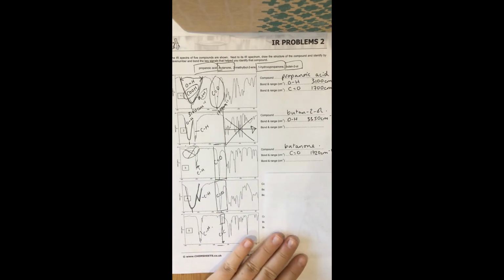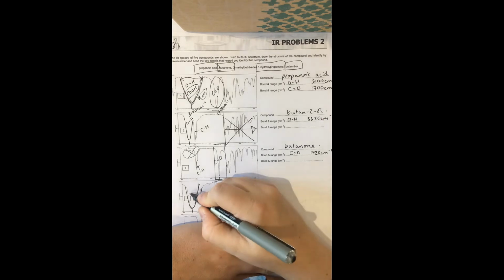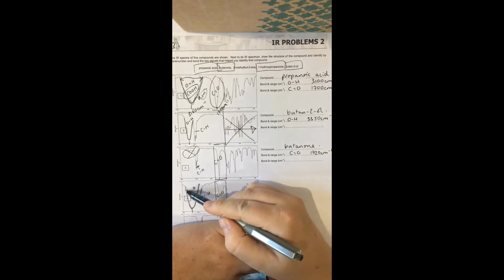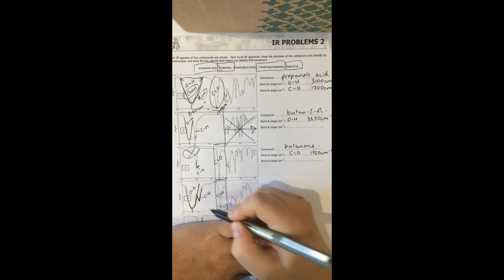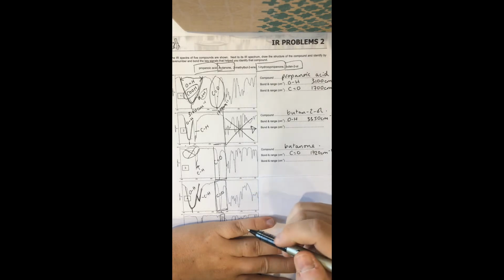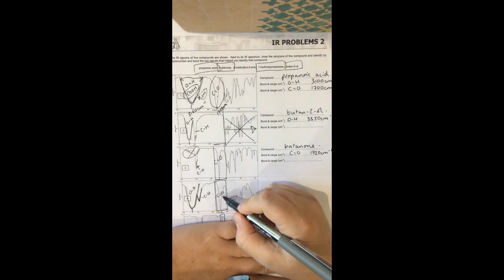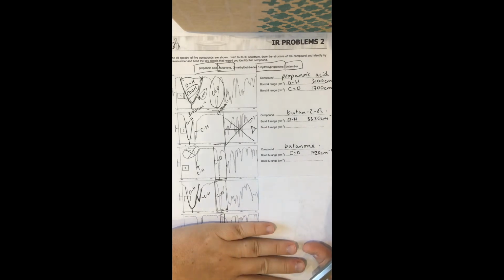The next one down, I'll hide that from you. You can see we've got an OH peak here. So it's quite broad. It's actually sort of somewhere between these two, but you can also see the CH peak next to it. What we also have though is this strong, sharp peak of a carbonyl group at around 1,700 wave numbers.